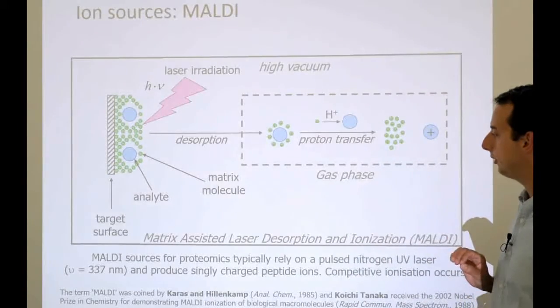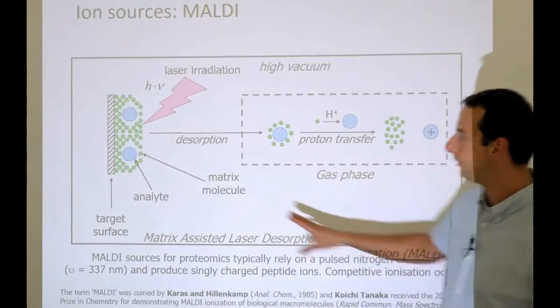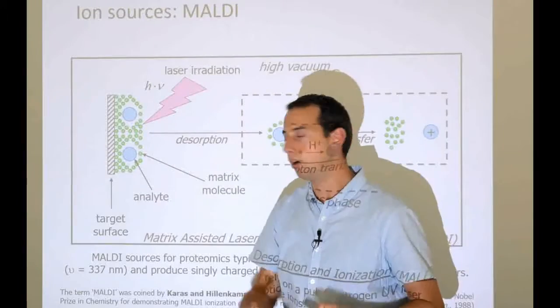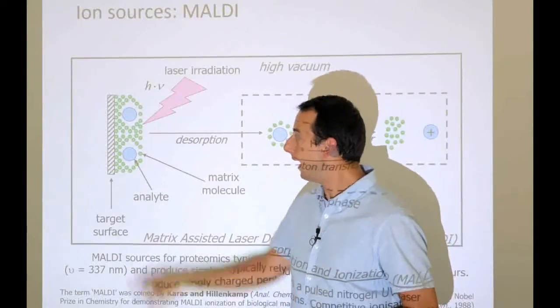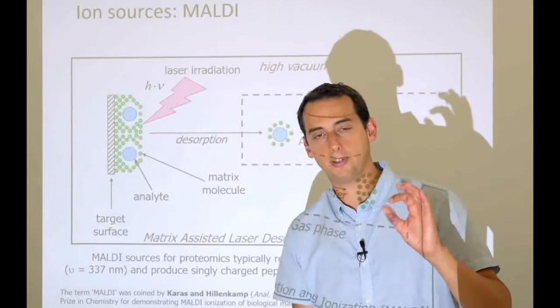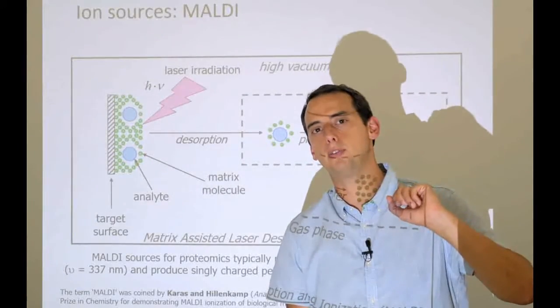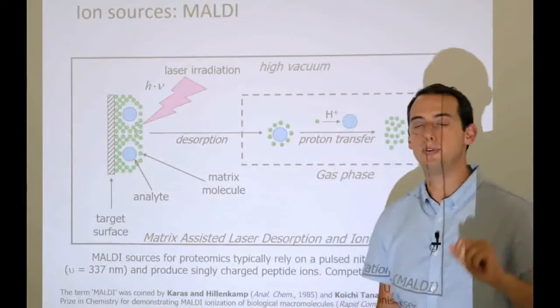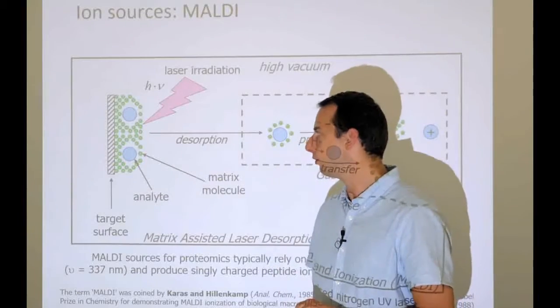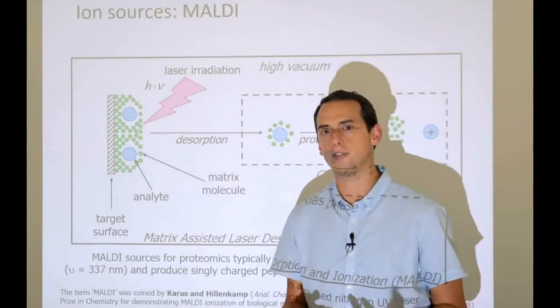So, matrix-assisted laser desorption ionization. Another thing to remember is that this is solid deposition of the analyte, and in fact this plate can be archived. When you shoot the plate with the laser, you can see little spots where the target and the matrix are being shot off the plate, but you could take it, freeze it, keep it out of light and frozen for a while and then reanalyze it afterwards. So the sample is kind of archived.